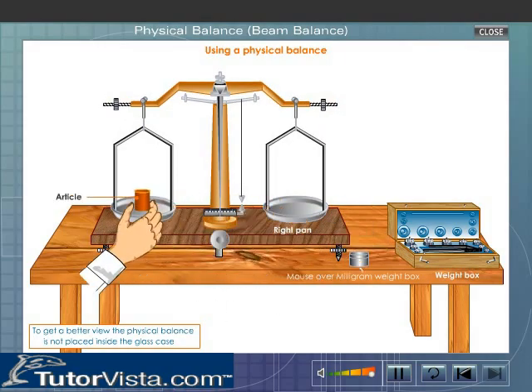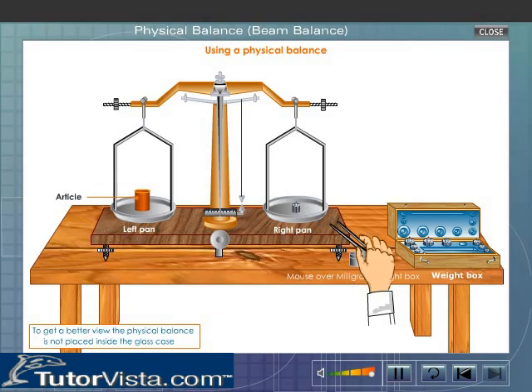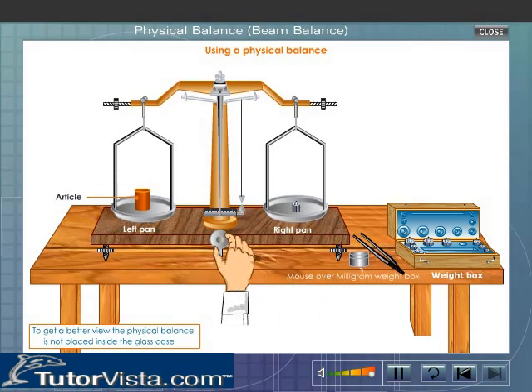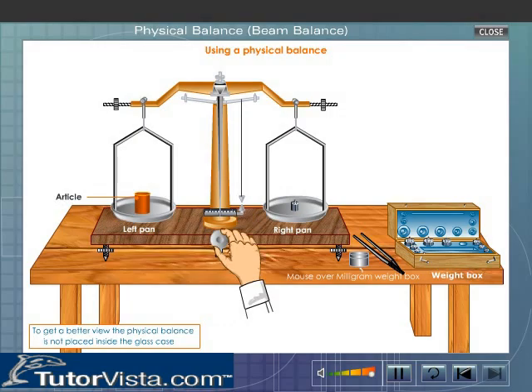Place standard weights in the right hand side pan till the pointer oscillates equally about the zero mark when the central rod is raised. Use forceps provided in the weight box.